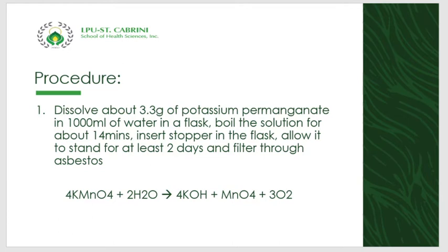So, you will see below the equation. Okay? So, there. Any organic matter, guys, that may be present in distilled water is decomposed by potassium permanganate. Okay, so consequently, after the solution of the permanganate is effected, the liquid is allowed to stand for 2 days to ensure, take note of this, completion of the decomposition reaction.